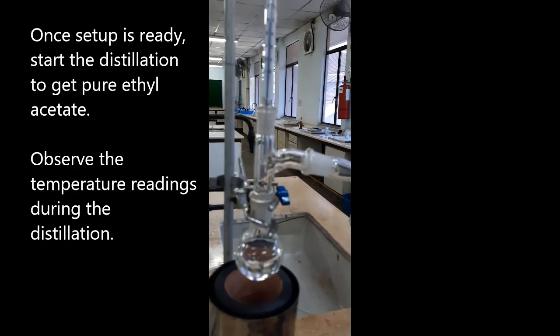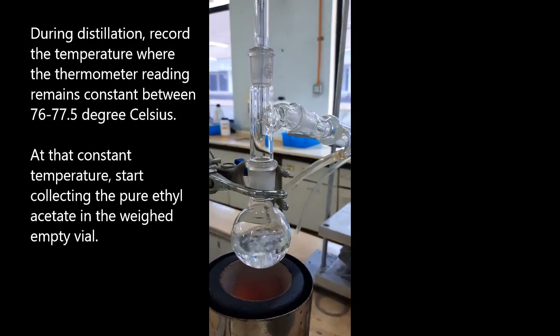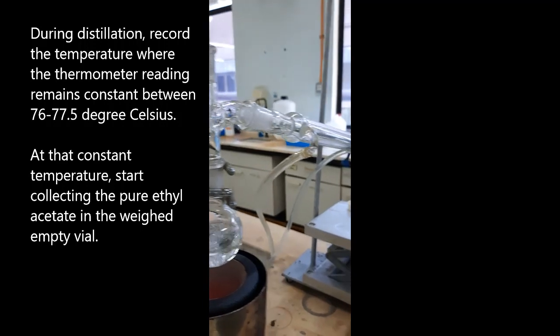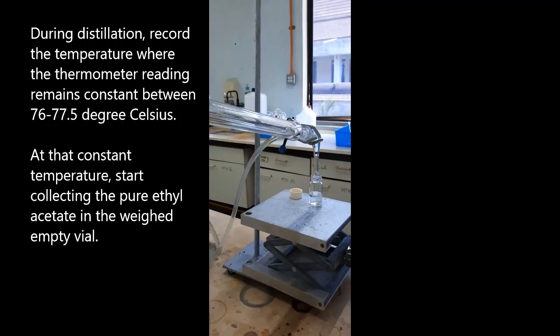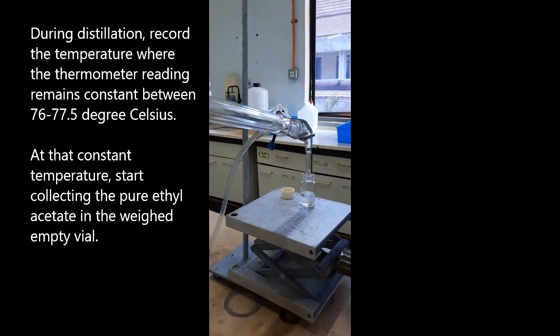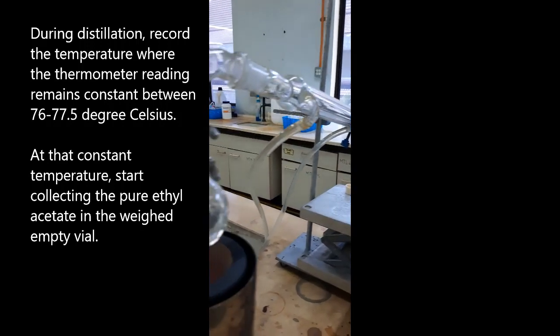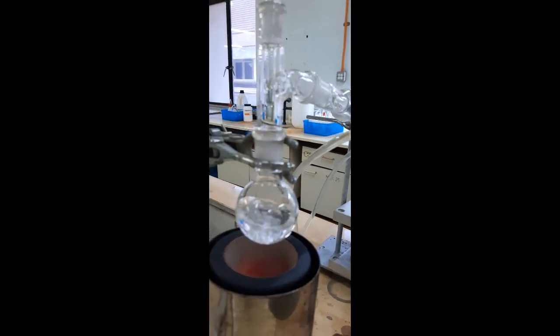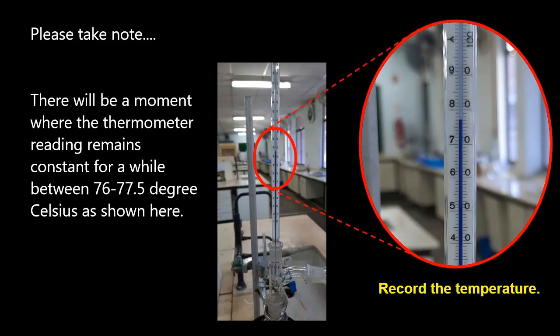During the distillation, record the temperature when the thermometer settles between 76 to 77.5 degrees Celsius. Use a pre-weighed empty vial to collect the condensed ethyl acetate product. Record the boiling point of the liquid when the temperature remains constant as shown here.